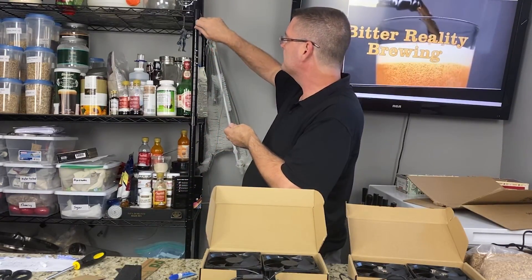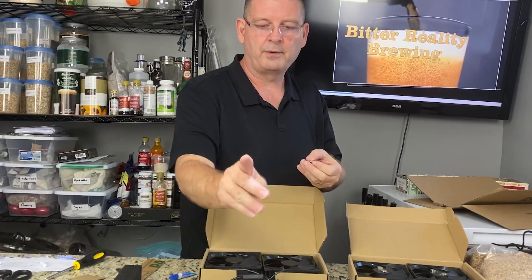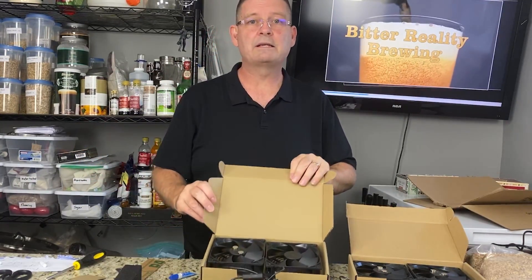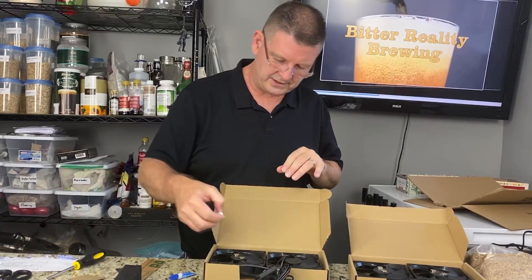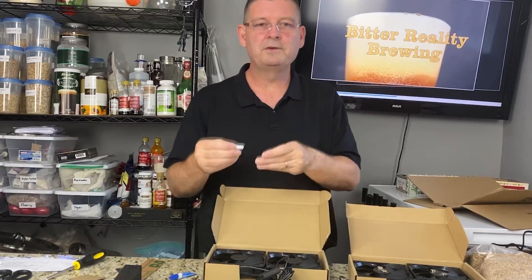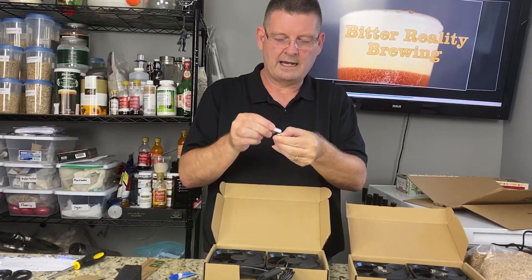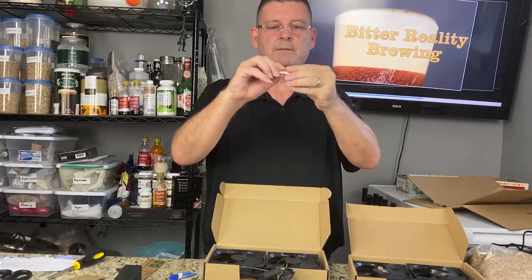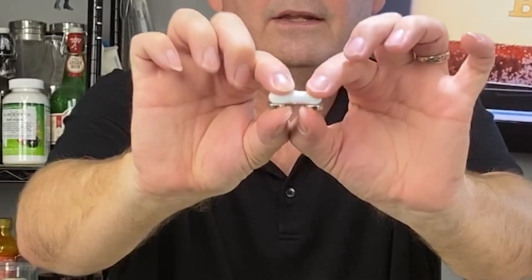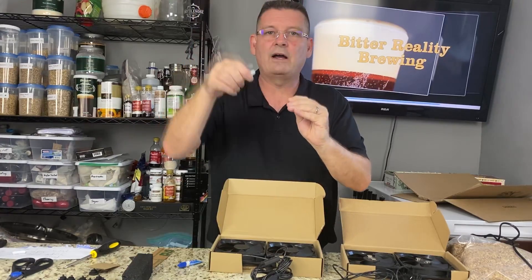You take two earth magnets — two simple little round disc earth magnets, 12 millimeters across, about 3 millimeters thick. Before you glue them you have to know which side is which polarity — positive and negative. You need to make sure they're oriented so they stick together correctly. If you flip one over it's not going to work — your stir bar will just fly all over the place and never work.